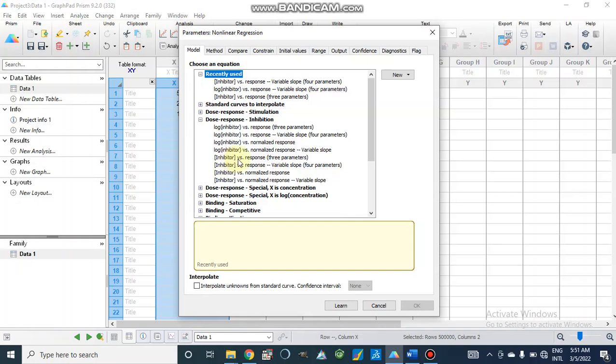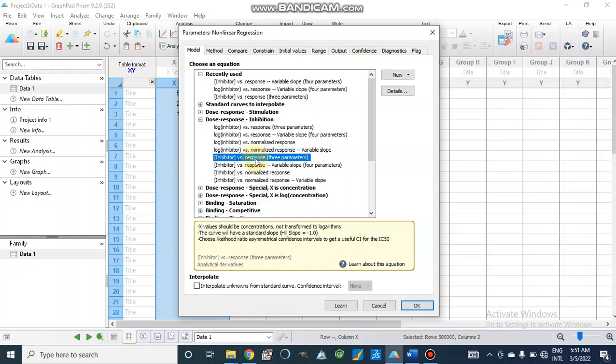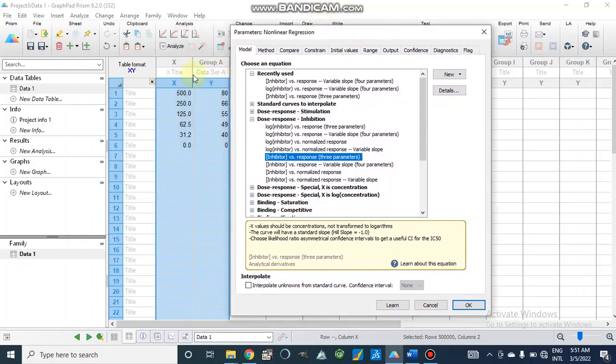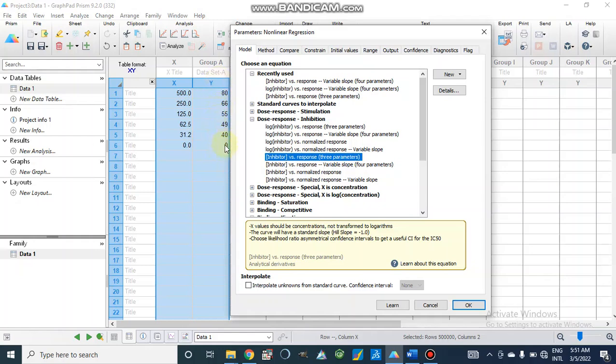Inhibitor concentration versus response. We have taken this kind of data. We can also use data where we take log of these inhibitor concentrations and then percentage inhibition, or we can plot against percentage activity and use this type of graph.